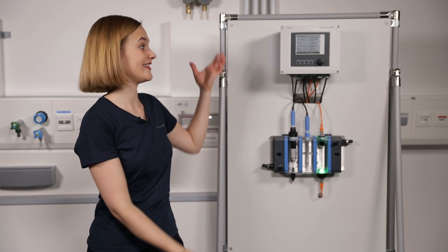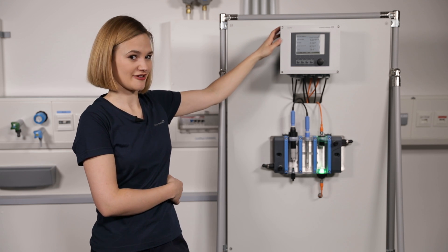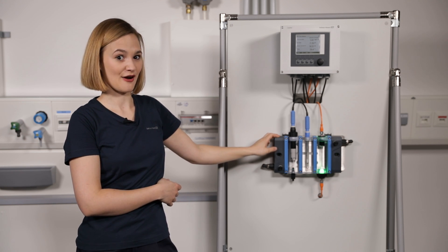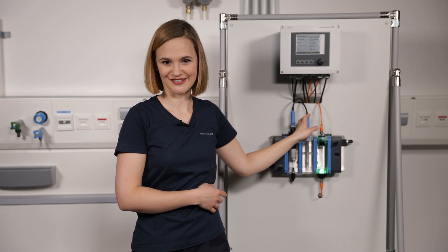May I present — this is the measuring point that I will calibrate now. You can see a Liquiline transmitter and our brand new Flowfit CYA27 multi-parameter assembly with a free chlorine and a pH sensor installed.